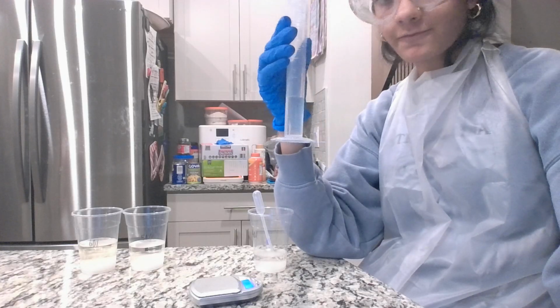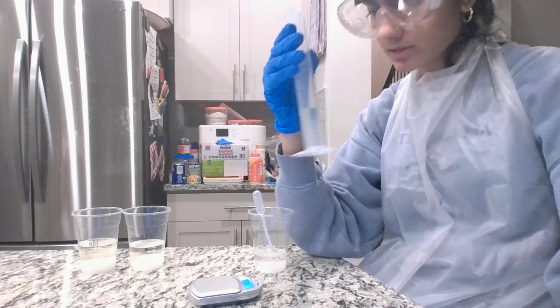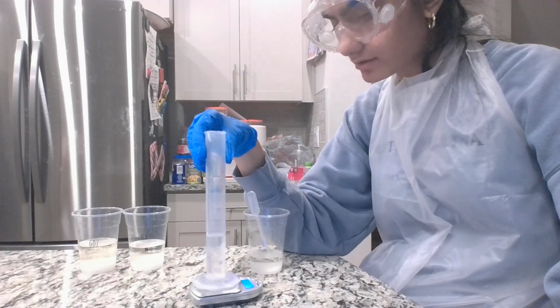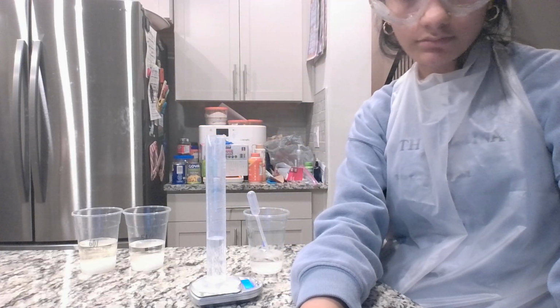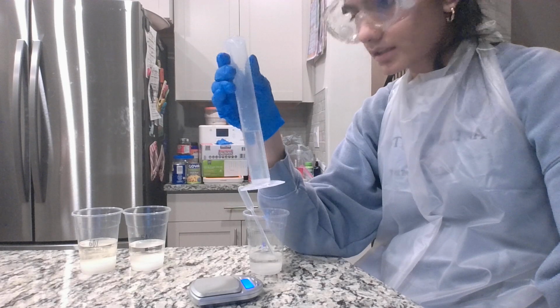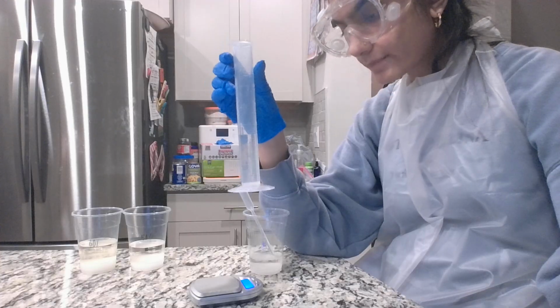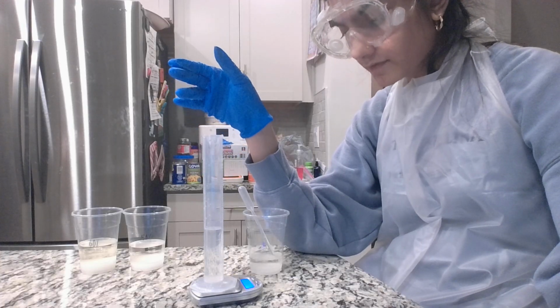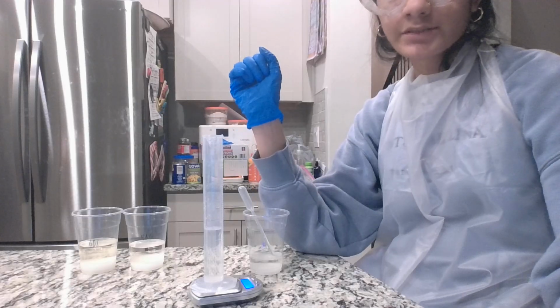This is 20 milliliters, and it weighs about 52.64 grams. This is 25 milliliters, and it weighs about 58.15 grams.